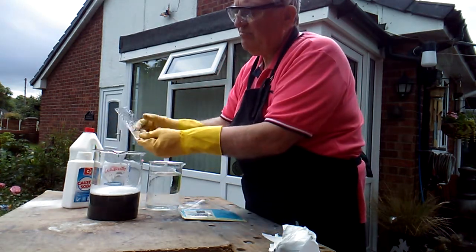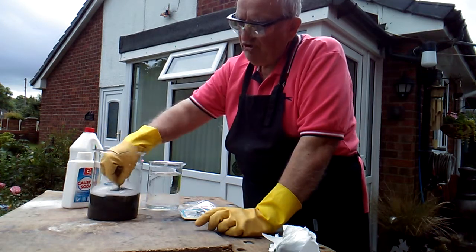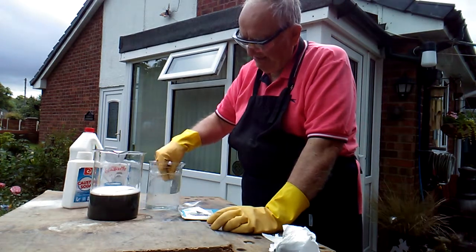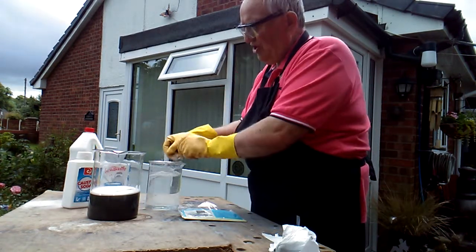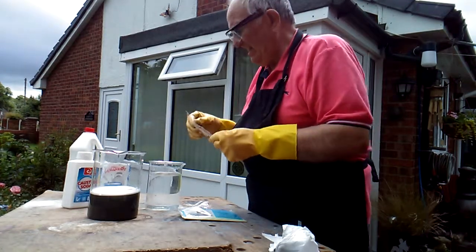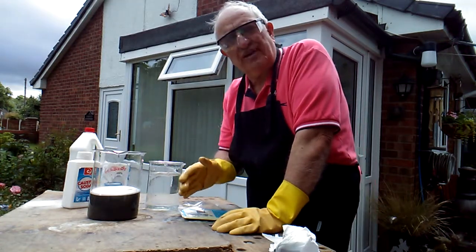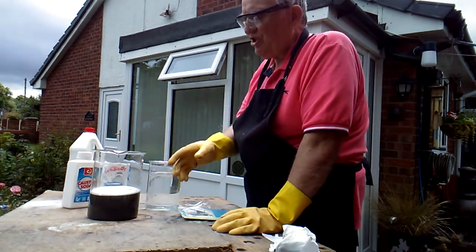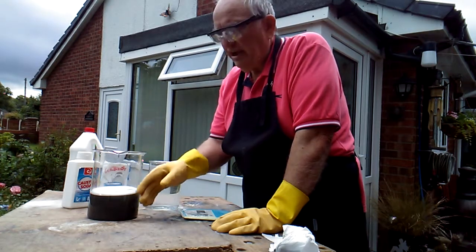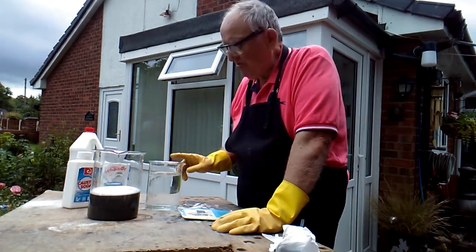You can see now that particular negative — a quite big one I kept to show you — has completely stripped off. I can wash it in my wash bucket. And now it's completely clear — washed off, completely clear. I'm going to weigh all the negatives once they've had all the stripping done and see how much silver has gone into that liquid. Once I've cleaned up and siphoned off as much of the bleach as I can off this liquid, I'm going to put it in a smaller beaker.